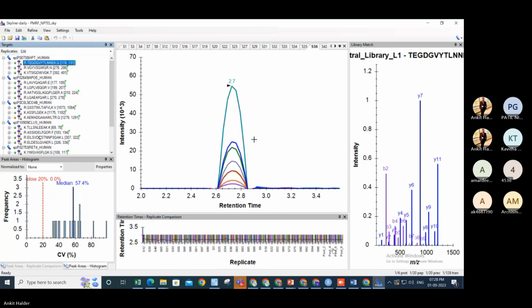If you have the peptide and you have given the transitions, then you can see the precursor and the many transitions, the products, that have been detected. If you give sufficient scan time and it gets detected at that particular collision energy, it will give you the peaks for the different peptides. This is that particular transition, that particular ion. The peak shape depends on the number of data points that have been acquired in that scan time.